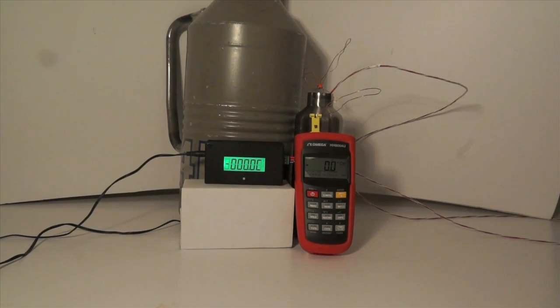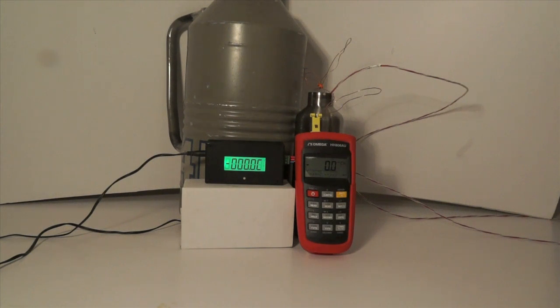Today I'm going to demonstrate a comparison of Crystal Clear Solutions' Crybaby cryogenic LCD digital thermometer against a known brand, the Omega, which uses a K-type probe versus the Crybaby's RTD probe.